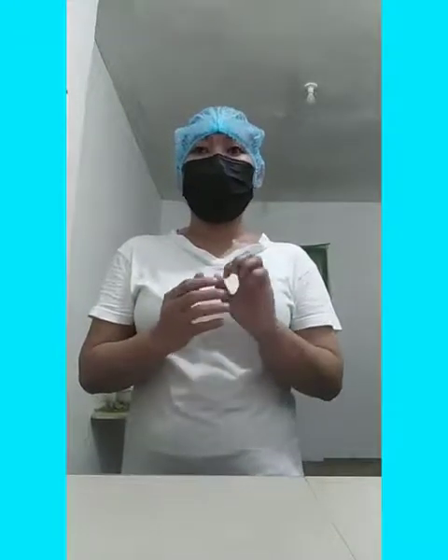Step 1. Self-gowning procedure. To don the gown properly, the scrub person should grasp the folded gown at the neckline and lift it directly upward from the sterile package. Step back from the table into an obstacle-free area. Carefully locate the gown's neckband and hold the inside front of the gown just below the band with both hands. Step 2. Allow the rest of the gown to unfold.